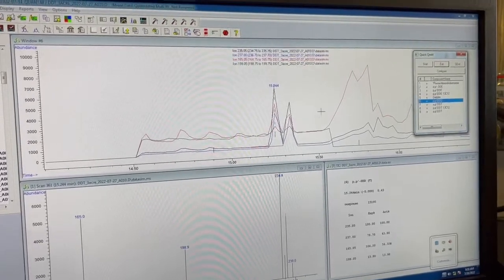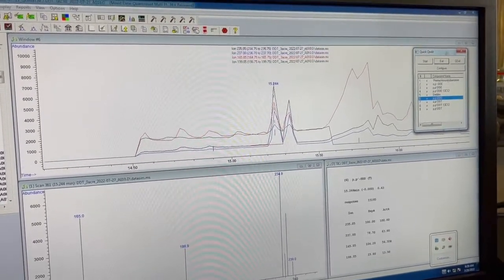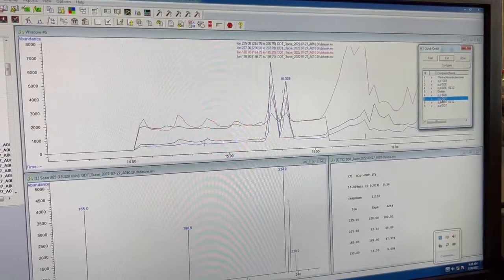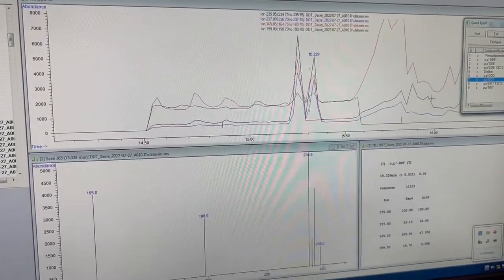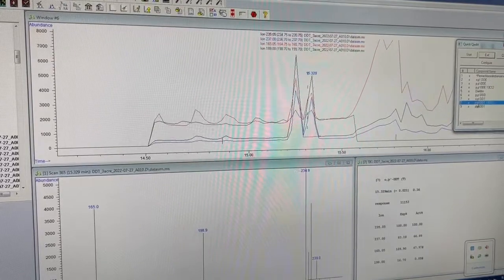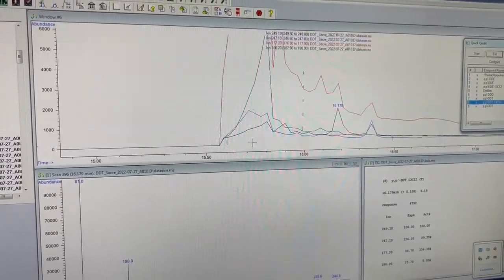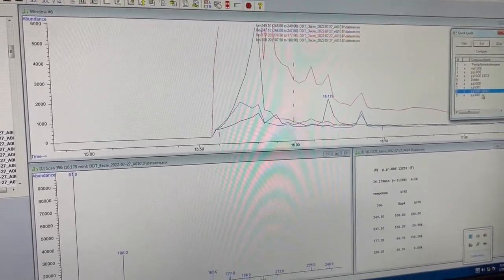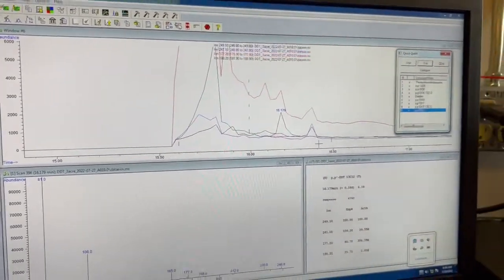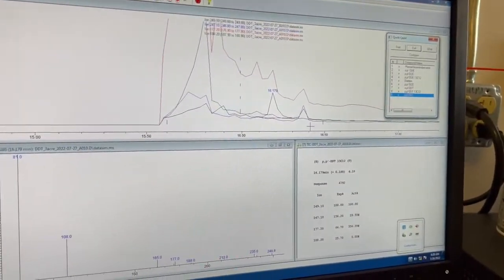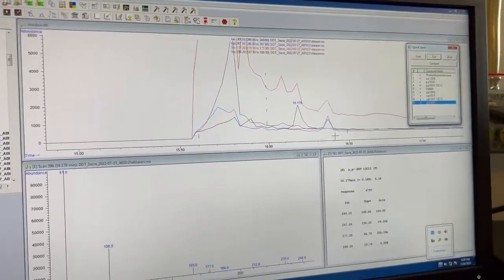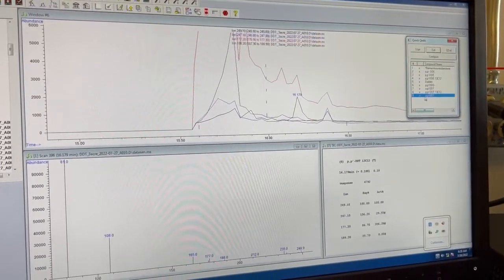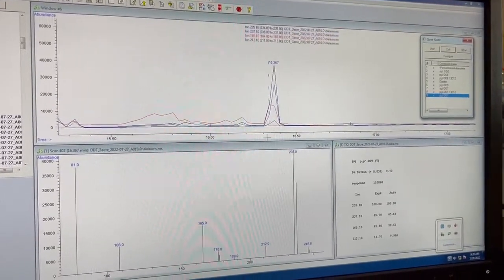And then next we have PPDD. So the brothers, they look good. They actually look okay. And they integrated pretty well. So I would say that that's good. Again, this peak isn't here, so you can see it's going to get creative. Yeah, they'll find some peaks as well. Which is fine. Again, like we're going to print out these results so we'll see them. But we know they're garbage so we can look at them.